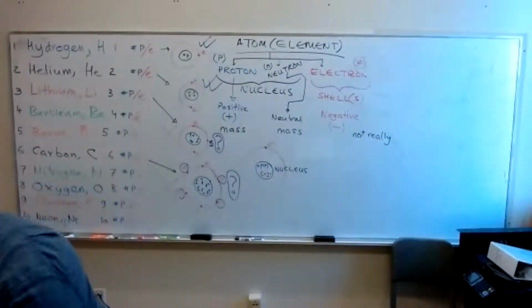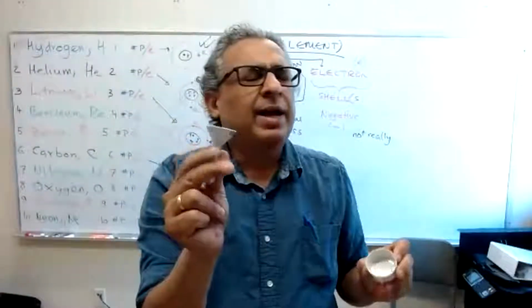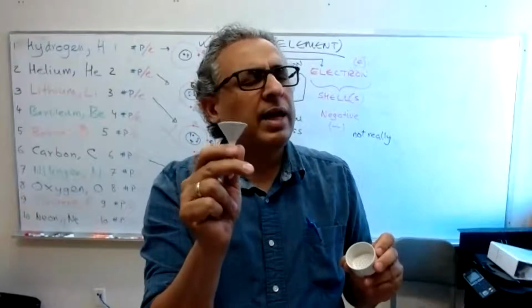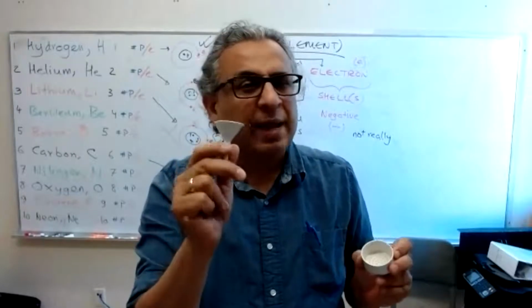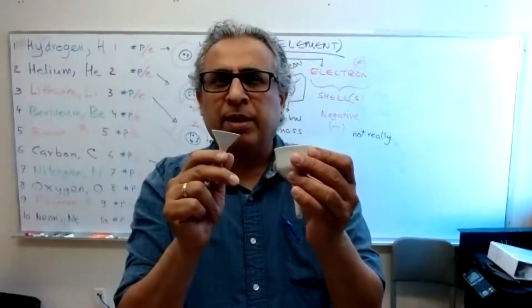So that's a Buchner funnel. This is called a Hirsch funnel, H-I-R-S-C-H. I think they're all names of different chemists. And this is Buchner, B-U-C-H-N-E-R. There might be an umlaut, probably a German guy.